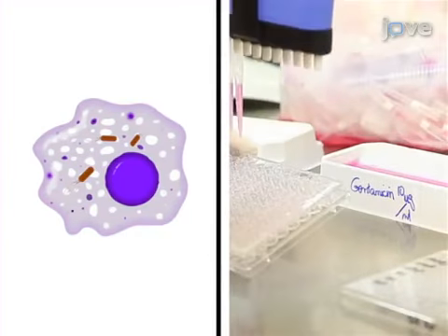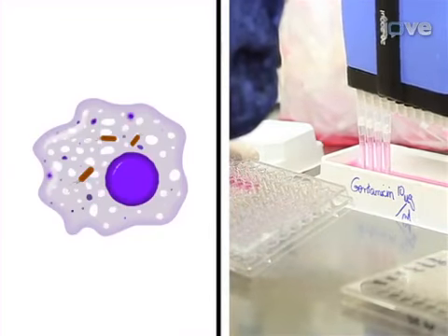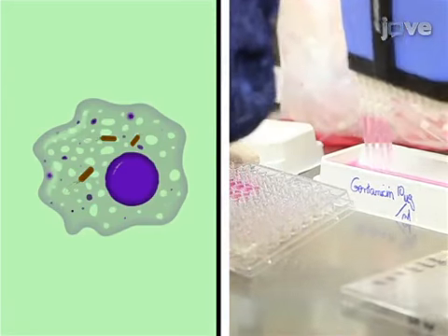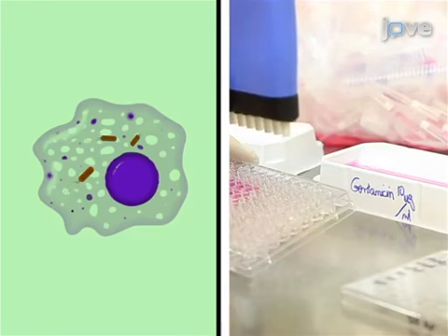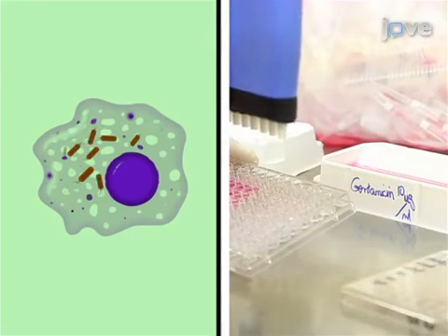Next, the macrophage cell culture is washed again, and fresh medium containing a low concentration of gentamicin is added for an additional 22.5-hour incubation in order to maintain a bacteria-free extracellular environment and allow only the intracellular Salmonella to survive and proliferate.